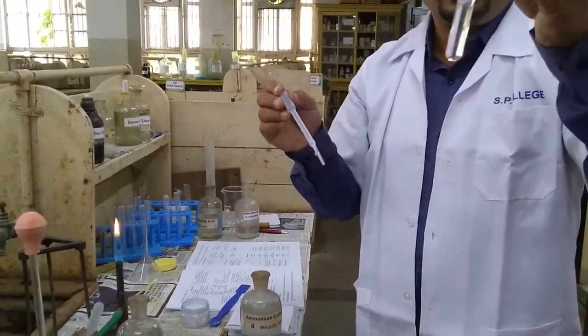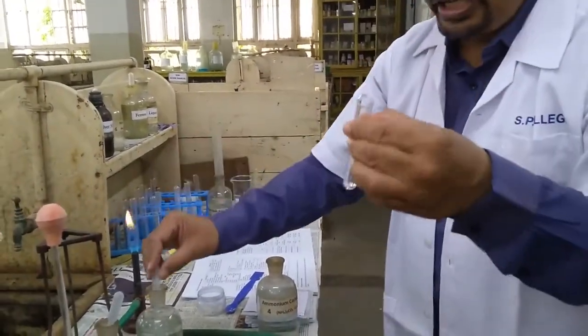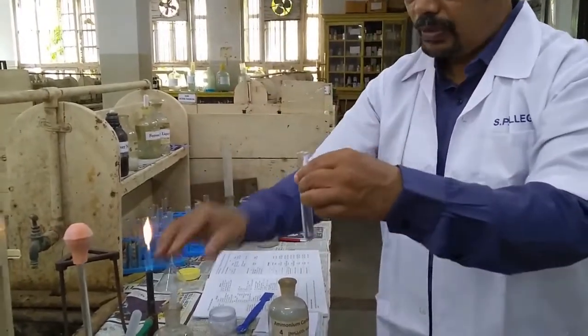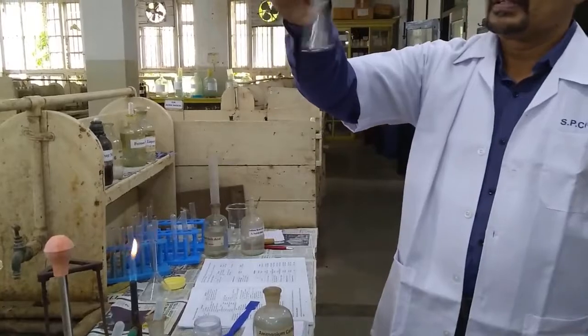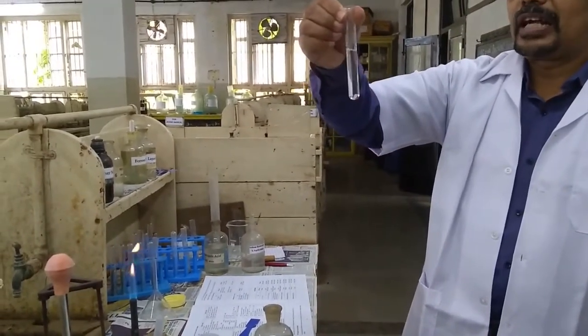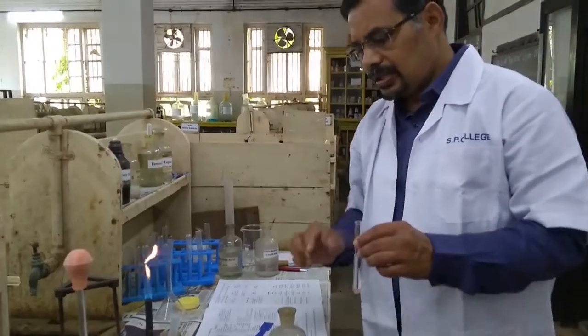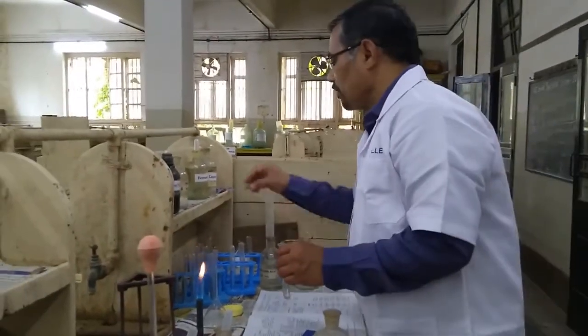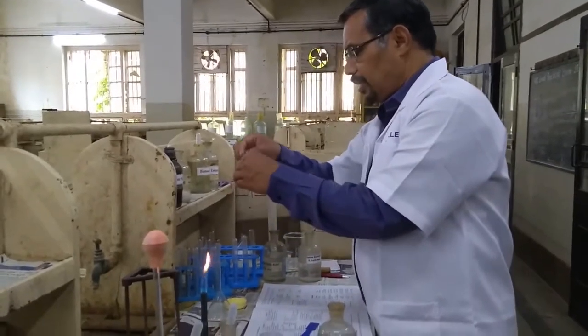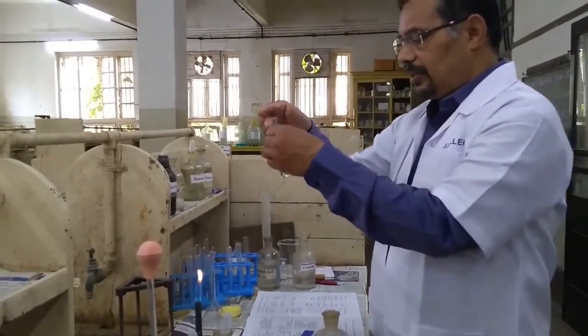So the color of this red litmus becomes blue. After mixing, the color becomes blue. That indicates the alkaline solution. The blue color of this litmus paper can be seen easily.